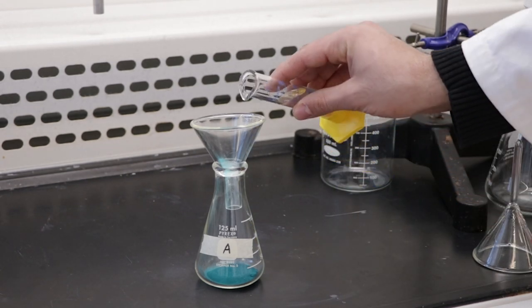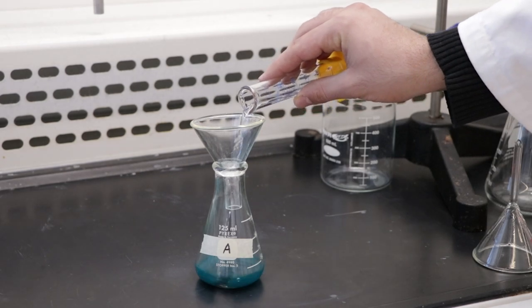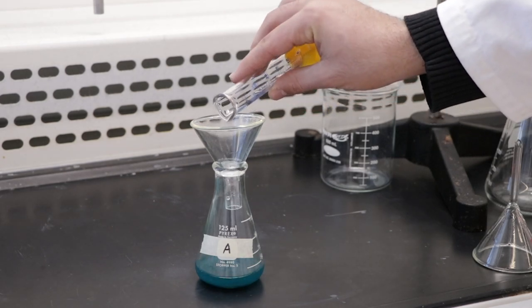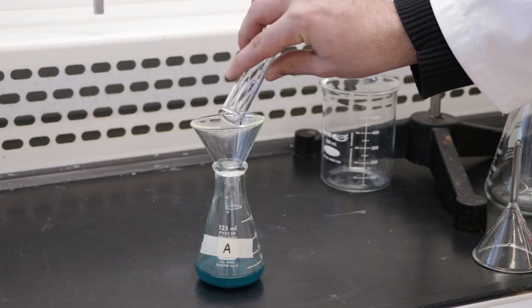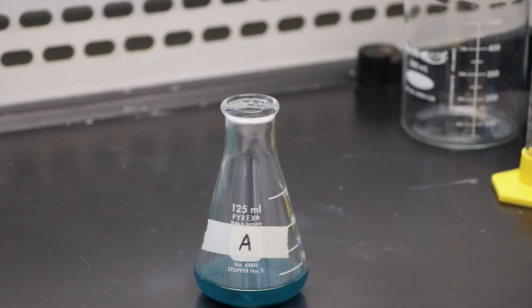Next, using a measuring cylinder, add 20 mL of distilled water to flask A. Wash down any solid adhering to the funnel with the distilled water before removing the funnel from the flask. Then place a glass rod in the flask.